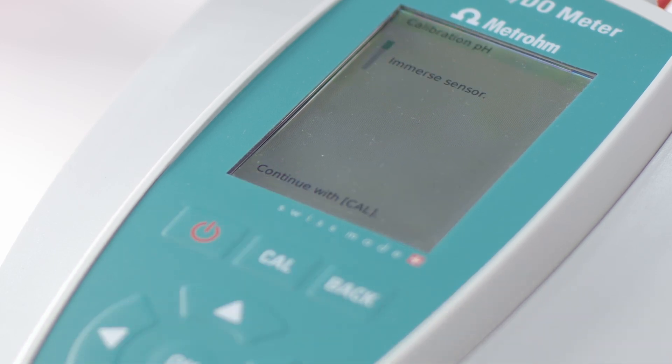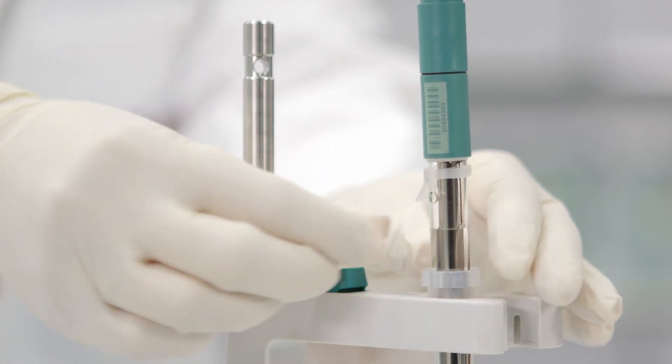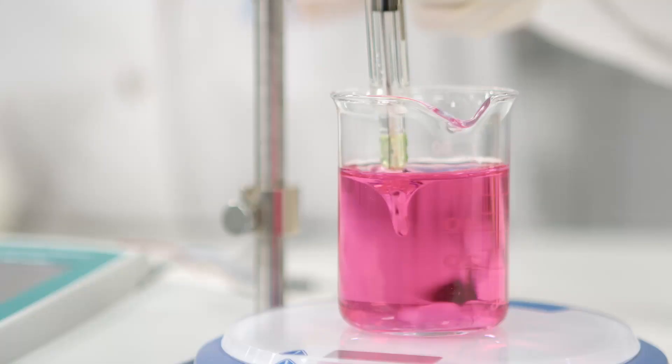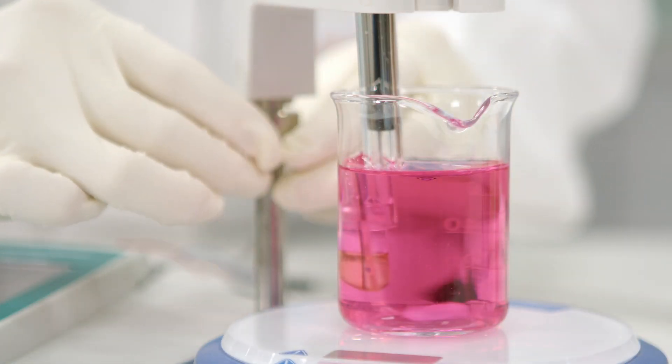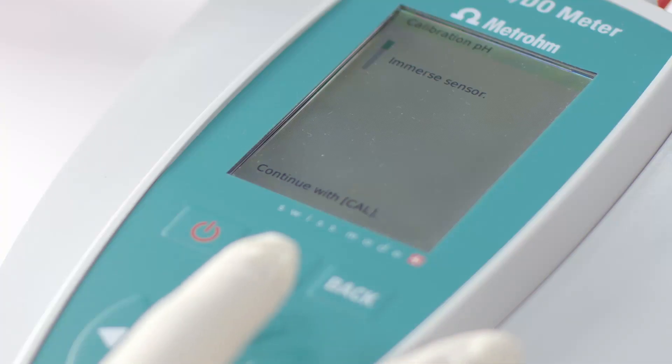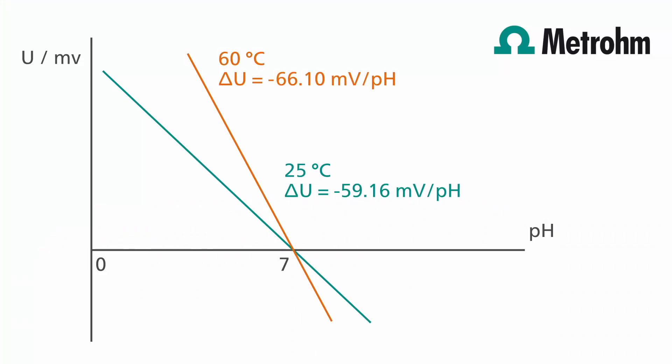Start the calibration by pressing the CAL button. Open the refill opening to avoid contamination of the diaphragm during the calibration. Immerse the pH electrode into the first buffer solution. Make sure that the glass membrane and the diaphragm are fully immersed in the buffer solution. Use the clamping ring to fix the position of your pH electrode. This ensures a consistent immersion depth and can prevent damaging the electrode by hitting the bottom of the beaker. Confirm the immersion of the sensor by pressing CAL. Enter the temperature of the buffer solution and confirm with CAL. If the pH electrode has a built-in temperature sensor, the measured temperature will be shown. Measuring the temperature is essential for a correct calibration, as the temperature influences the slope of the electrode.